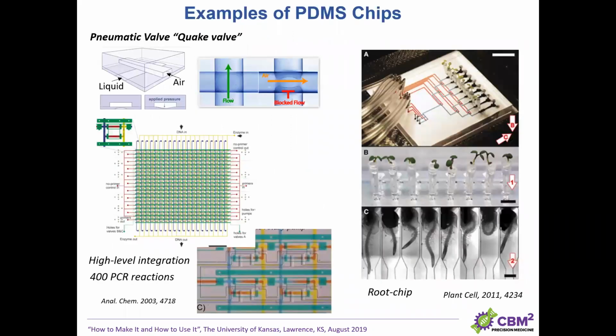As far as examples of PDMS, if anybody had an idea in the microfluidic field, you can be 100% sure that somebody either tried to make it or successfully made it in PDMS, pretty much from the beginning of microfluidics, from simple electrophoretic separation on chip to highly integrated chips. There are examples of it being done in microfluidics. You can find a lot of literature on this subject.